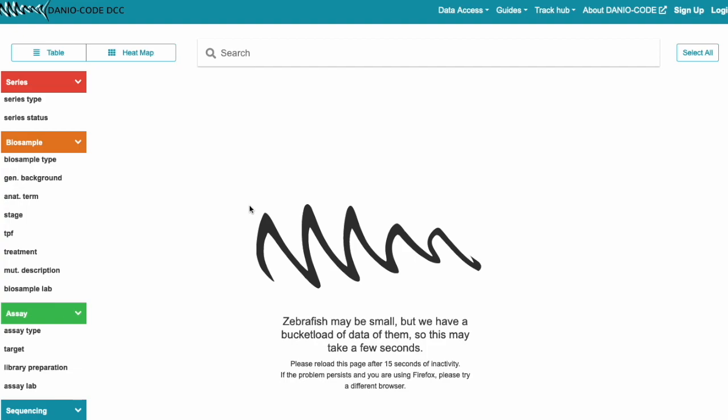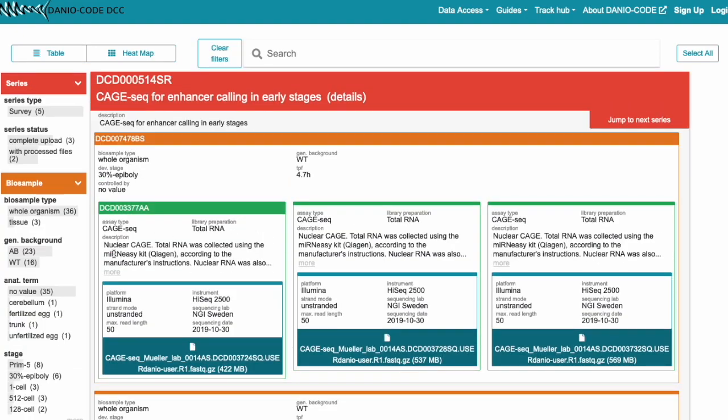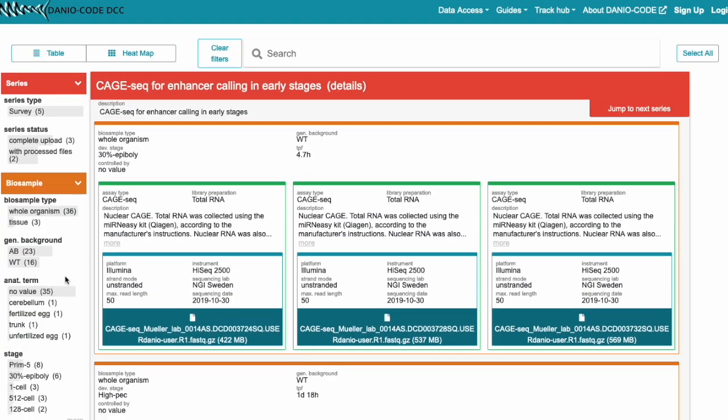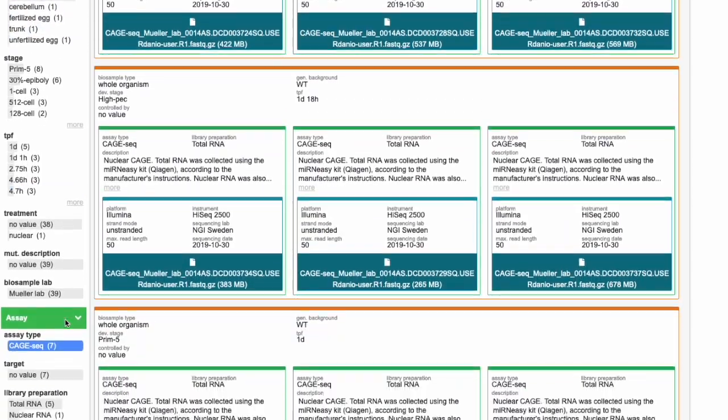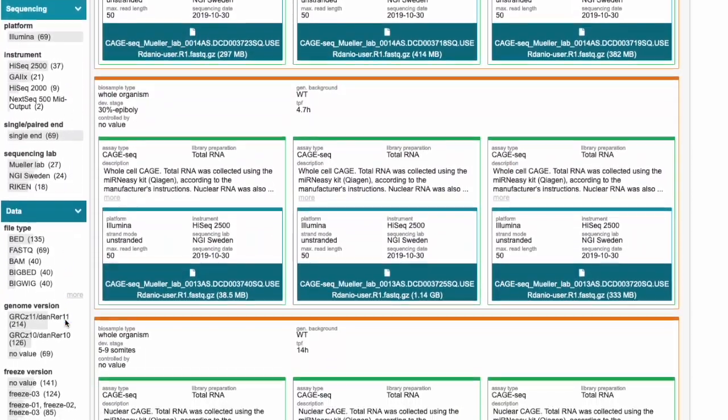Which is already filtered for just the CAGE data. We will now further filter it down to the DanioCode 10 versions and only the bigwig files.